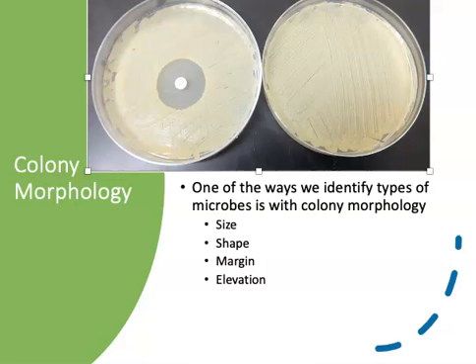Remember, that word morphology translates as body form. We can look at a colony and we can describe its physical, visible features. The features of a colony are one of the characteristics for that particular organism. Just like you and I have physical characteristics, like we have a certain height and we have a certain hair color, a certain skin color, a certain eye color. So too do colonies have certain physical characteristics.